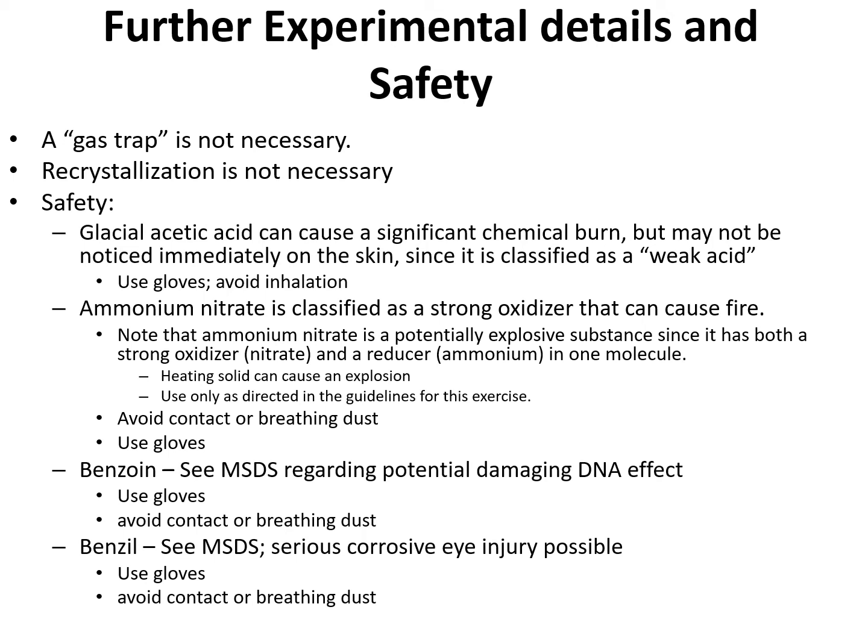The acid also has a strong smell, and it's better if we can avoid inhaling it. And of course, ammonium nitrate is a very strong oxidizer, which can cause fire under certain heating, and even the solid can cause explosion if it is heated above the recommended range.